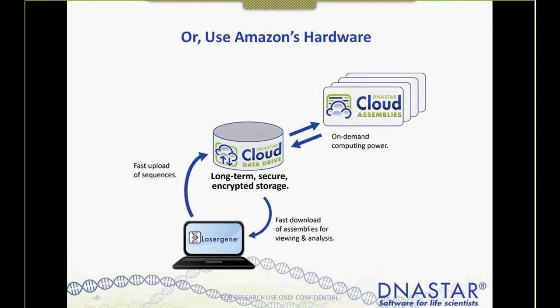and we just make the cloud connection, and it uses a secure HTTPS connection to upload the data, and then the data is assembled up on the cloud computer, and then you can return it down locally for analysis. And there's some advantages to that. One, you don't have to store all the data locally. Two, you don't have to maintain hardware. You can have very minimal hardware.